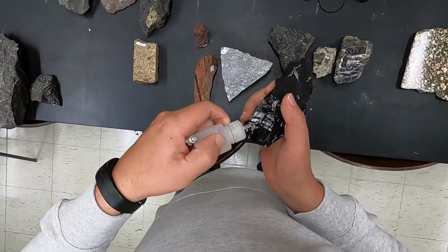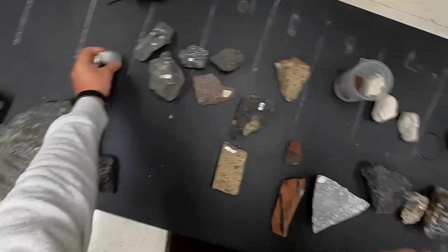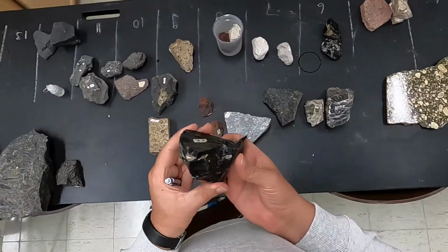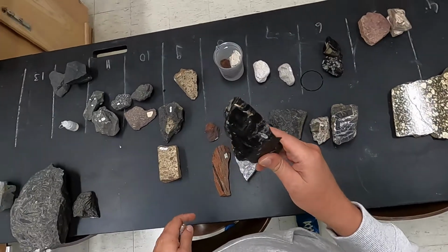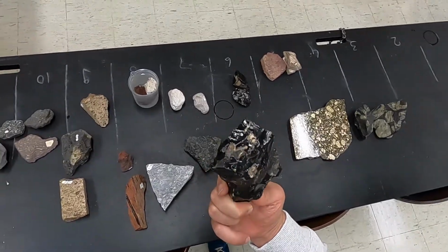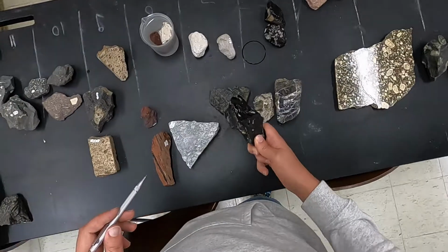And it looks like in this case, this is a classical product of alteration of the obsidian. So if you alter glass, quite often you end up with clays as a result of that alteration. And so that's not uncommon, really, to find clays associated with obsidians.